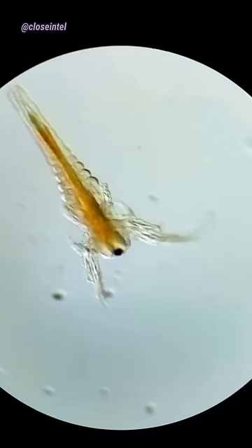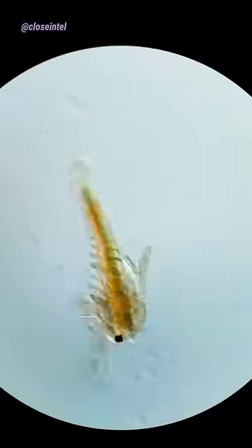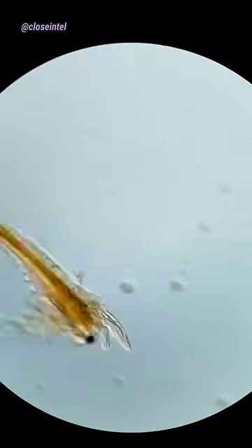Sea monkeys get up to around 2 inches and should grow at least to 1 inch in 1 month. I'll keep you all updated on them as they grow.